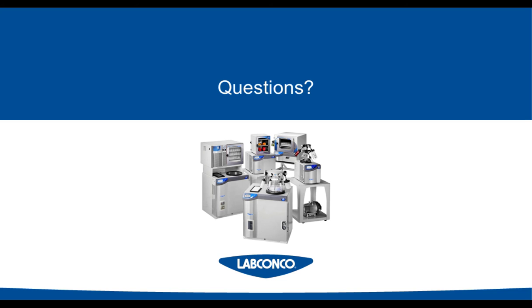So it really is going to be dependent on what your sample is. In general, we do recommend the 0.2 millibar. It will help speed up your lyophilization process. So I think that's what they were asking. If not, I can follow up with an email just to make sure that we got that one covered.